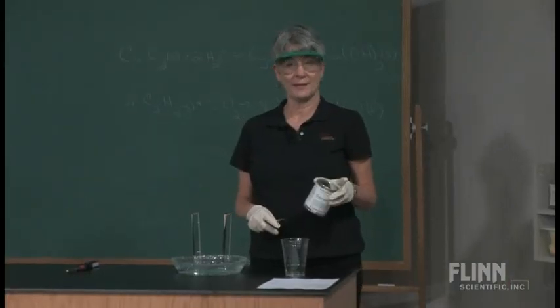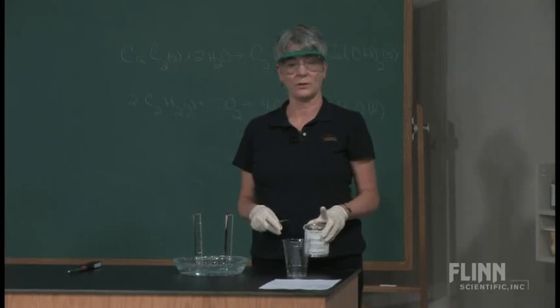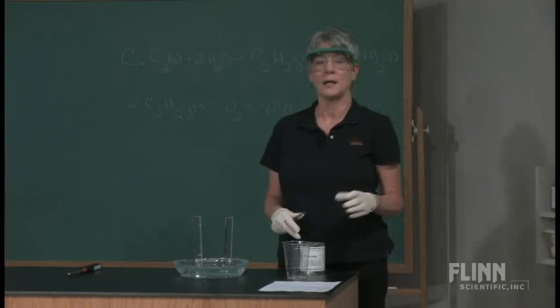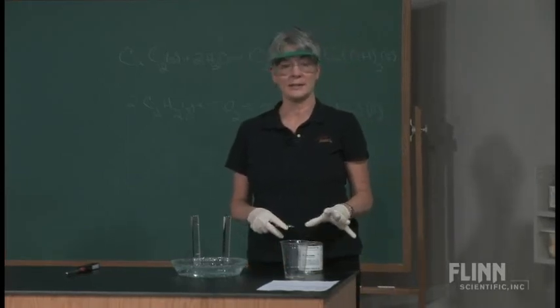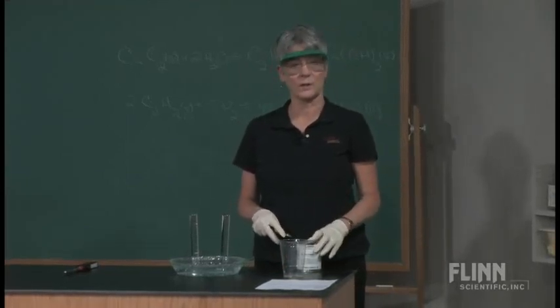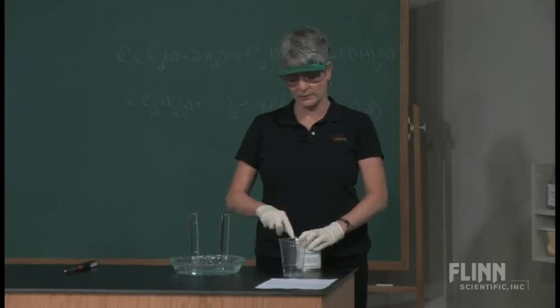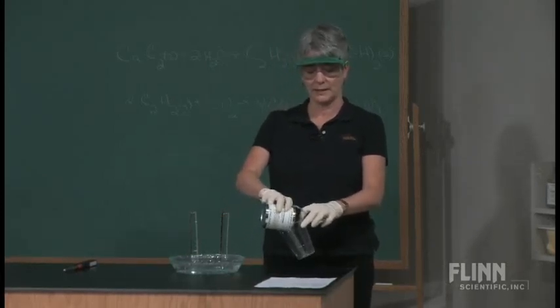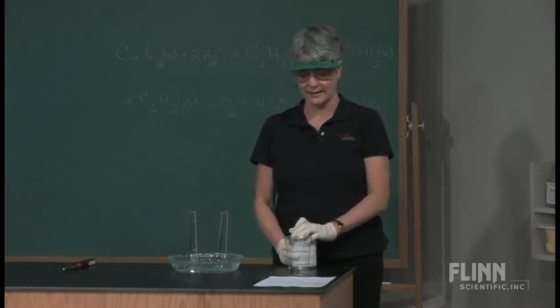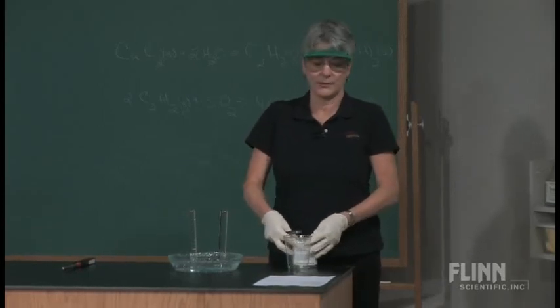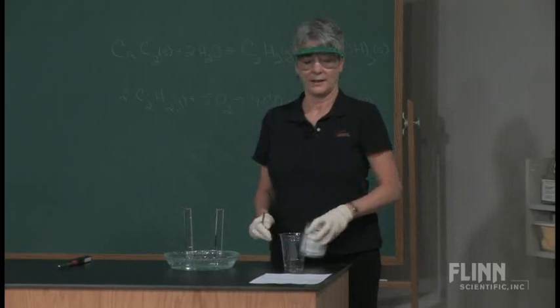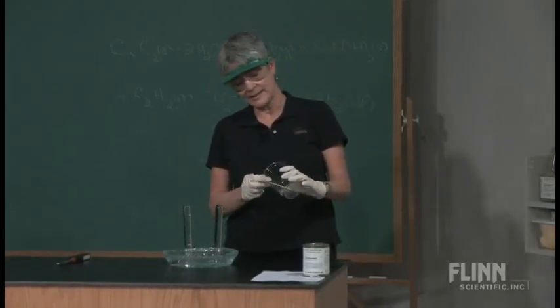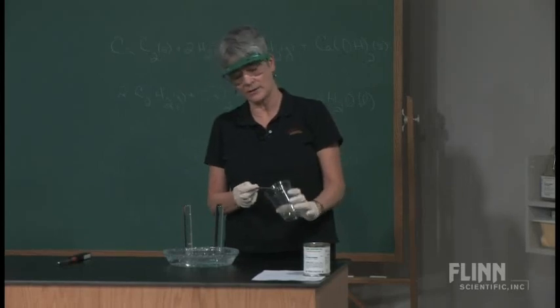Please make sure you don't get the calcium carbide wet. You want to wear gloves because if your hands are wet and then you touch the calcium carbide, you can get a burn and it's not fun. I had that experience once. So what I usually do is I put a little bit of the calcium carbide in a container that I can easily get things out of, then put the top back on and get it out of my way. I'm going to put just a piece of calcium carbide under these test tubes and collect the gas generated.